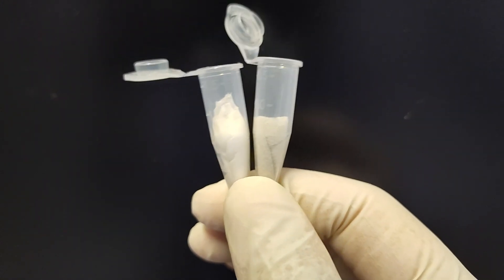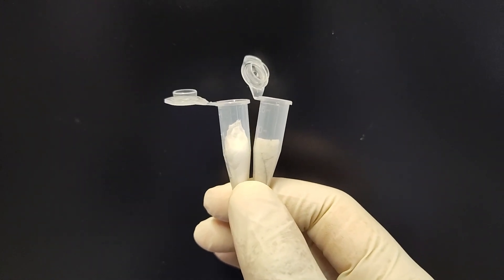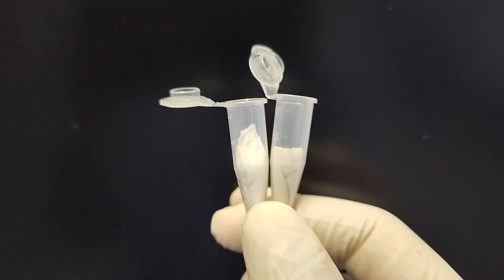You can tell the difference in the color of the wipe inside the tube. On the right we have the dirty wipe; on the left we have the control clean wipe. I'm going to extract it with two parts isopropanol, one part acetonitrile, and then put it on direct injection.